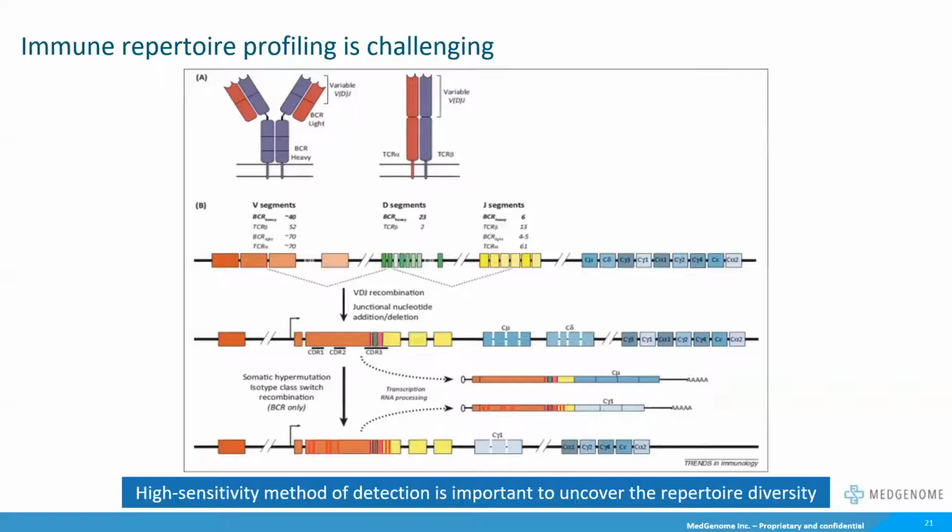The diversity of the TCR repertoire is analyzed by looking at the unique number of CDR3 that you see in the middle of your screen. And these CDR3s are important because when specific T cells with unique TCRs expand by binding to an antigen, there is a selective expansion of CDR3. When one such T cell clone dominates, what we call a clonotype, the clonotype gains importance into understanding immune response. We have about 10 to the power 10 unique TCRs, and the diversity of this VDJ recombination is why we have such a strong army of T cells and B cells behind us that help us protect ourselves against infection.